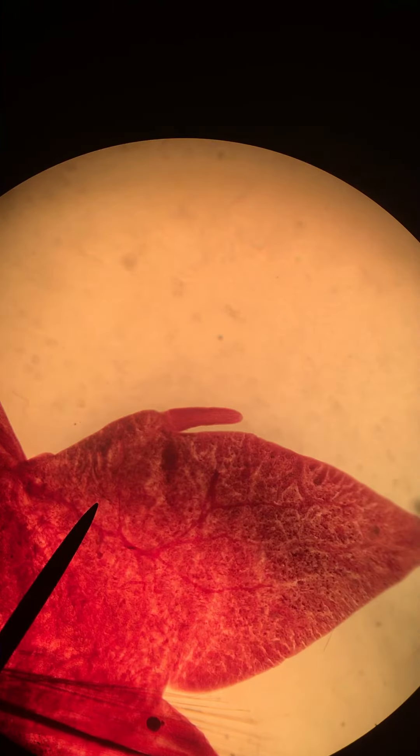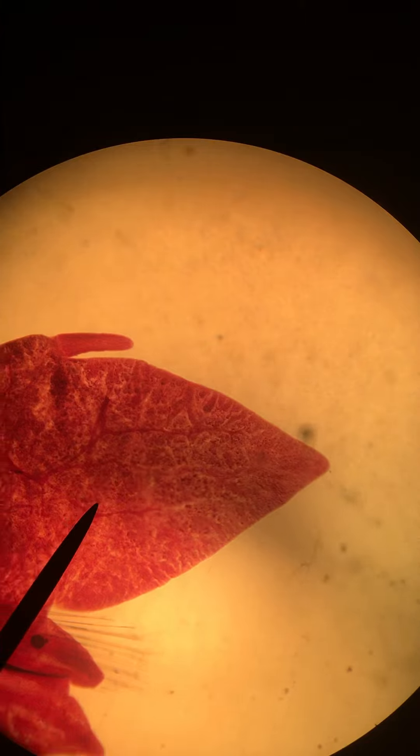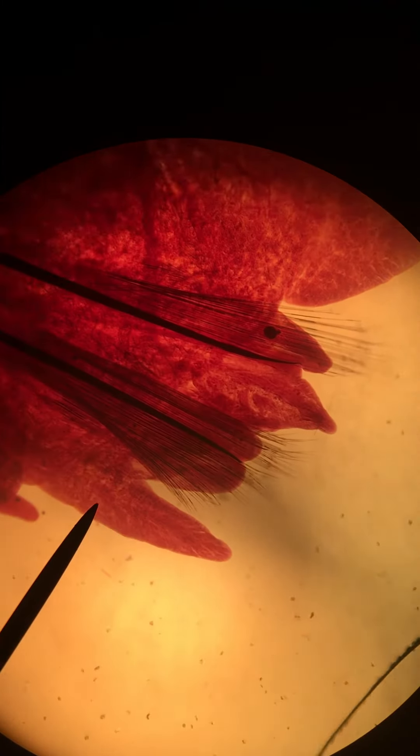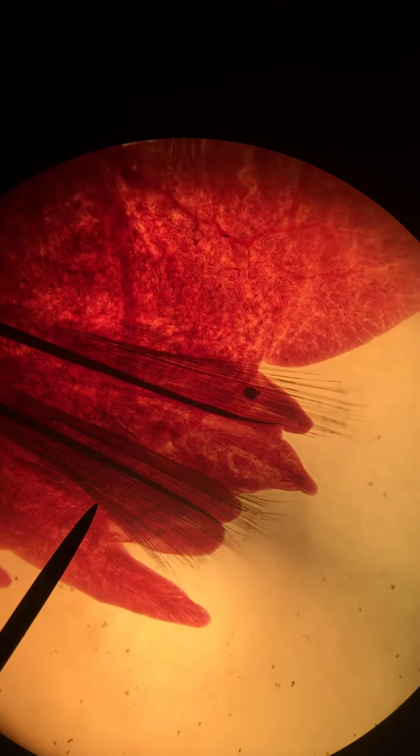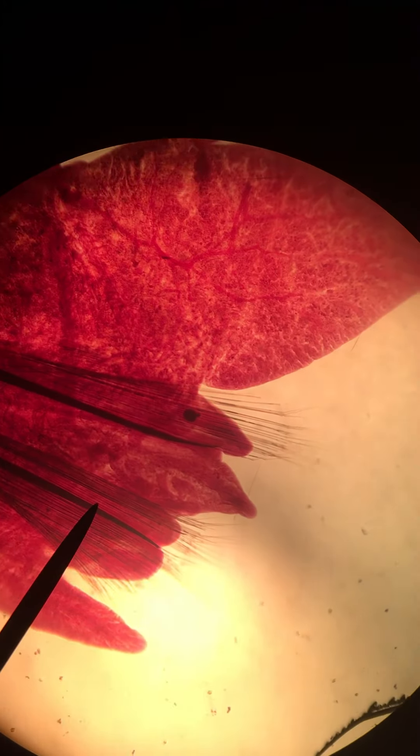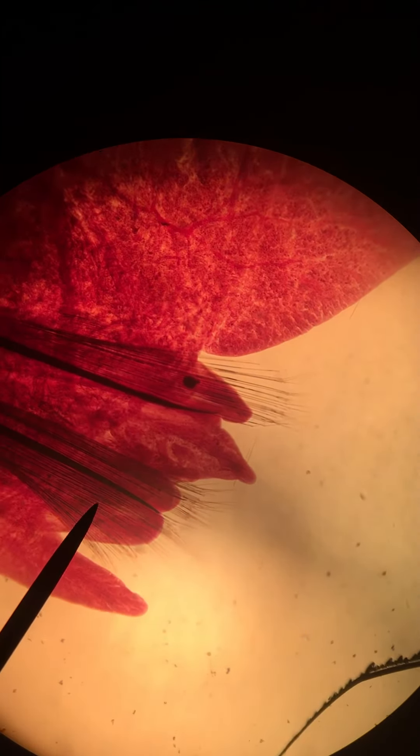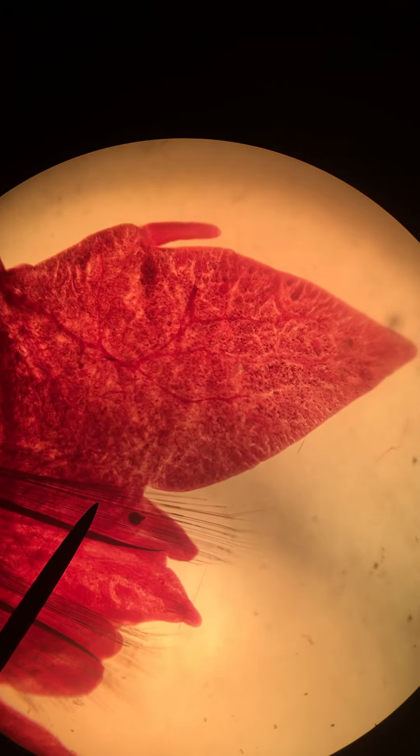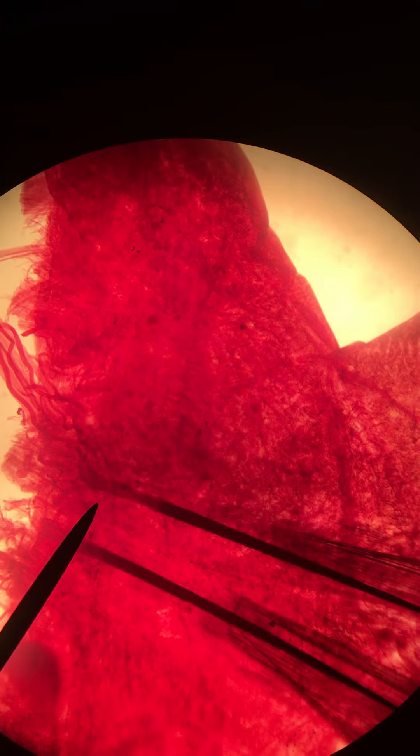We've got the dorsal part, that's the notopodium, the ventral part, that's the neuropodium, the aciculi are the support structures, and then the fibrous structures are called setae. All right, that's it for this one.